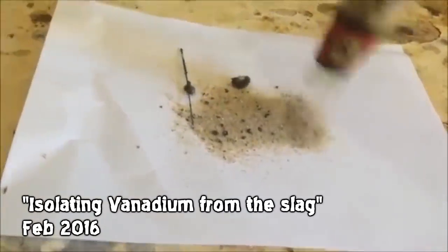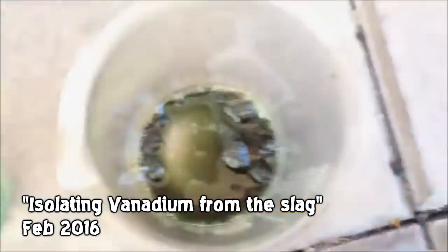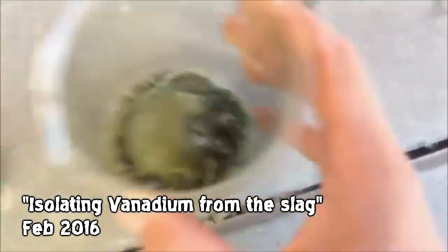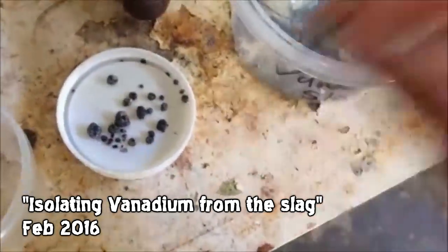I think it's called 'isolating vanadium from the slag' — I think it's one of the least watched videos on this channel, which is fair enough. I'm just hitting stuff with a hammer and picking up metal. So we have these lumps of metal, but there's not a whole lot of them. We have some more vanadium pentoxide — that's all I have here.